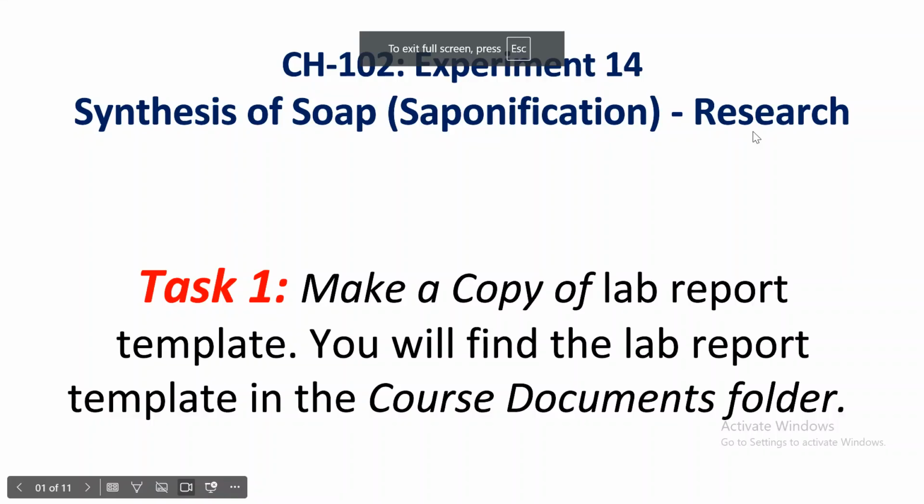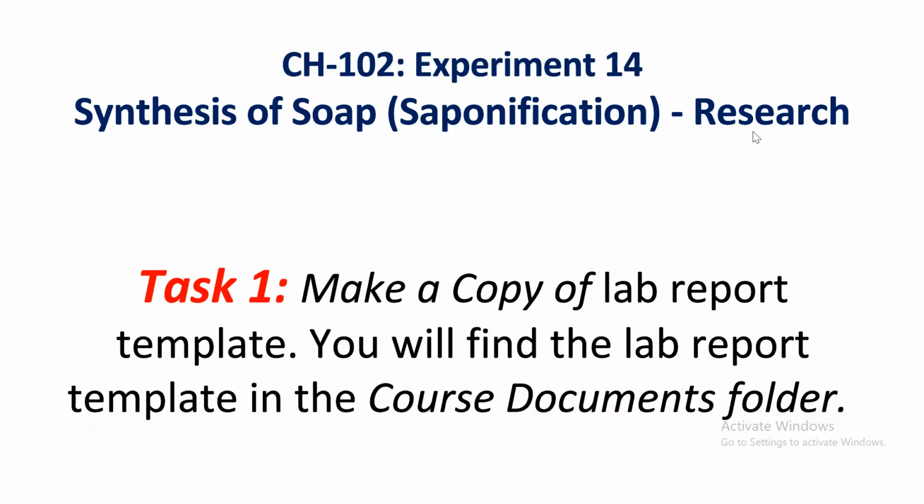Experiment number 14 is called synthesis of soap, and the process is called saponification, and this will be our research experiment. So, the first task I want you to do is go to our Brightspace platform, make a copy of the lab report template and edit the template as we are going, and make sure you write the answers that will be provided in this PowerPoint.